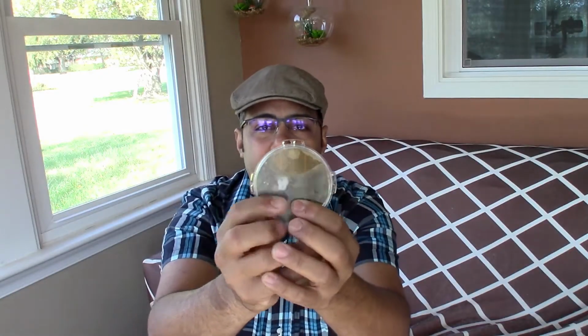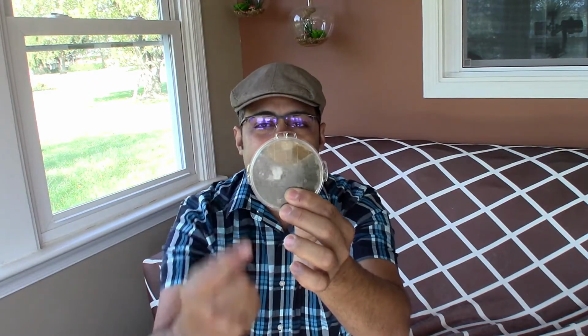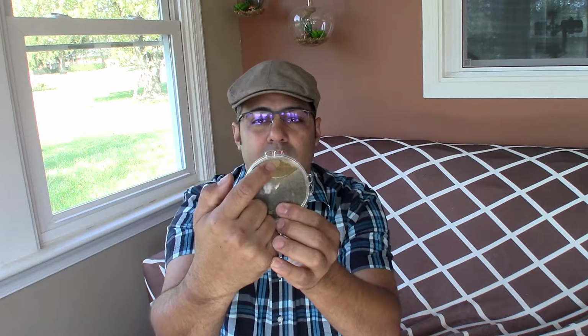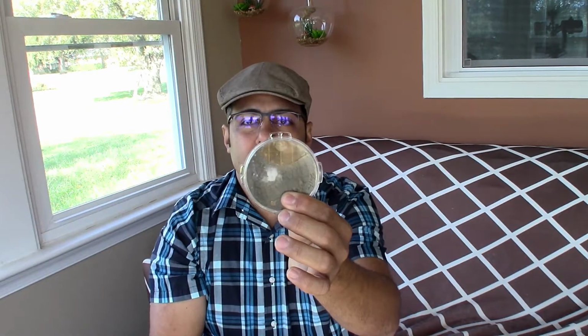This organism here is inhibiting the growth of this other filamentous mold. How do I know that? Because it should be growing in a circle pattern, and it's not. It's creating this concave area here. From the center of this microorganism, in this case the yeast, to here, there's approximately 2 centimeters, a little bit more than 2 centimeters, so we're talking about 20 millimeters.